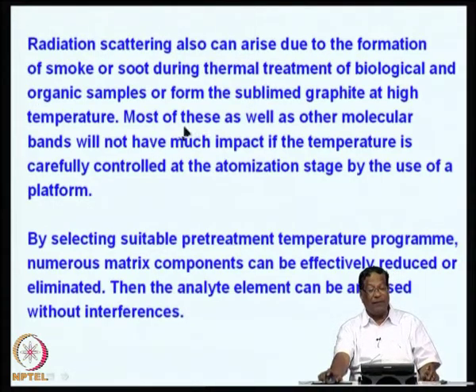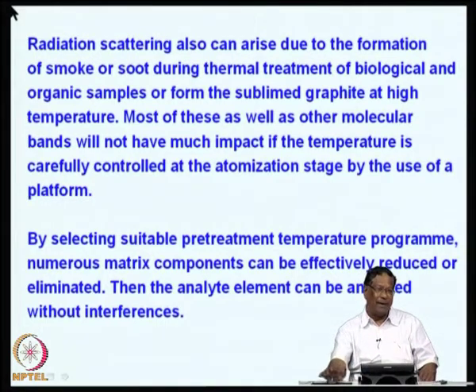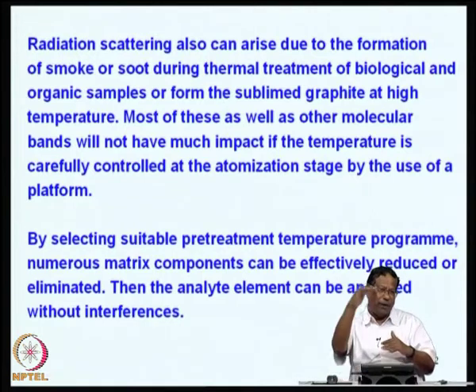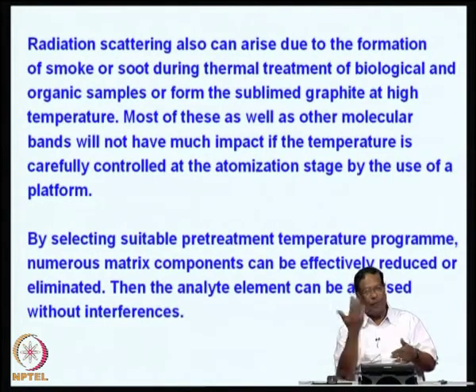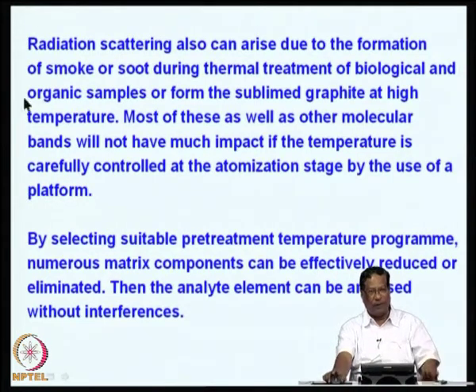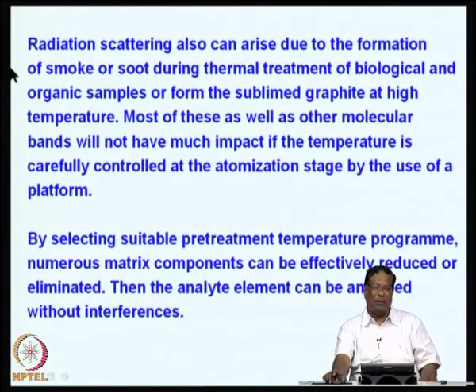Most of these, as well as other molecular bands, will not have much impact if the temperature is carefully controlled at the atomization stage itself. That is why we prefer the platform. There is no direct contact, so the platform will be heated only by the radiation. It will sluggishly follow the actual applied temperature, whereas if it is direct contact, then whatever temperature we give, it will follow fast. Because it is radiation controlled, the platform temperature will slowly reach the applied temperature.